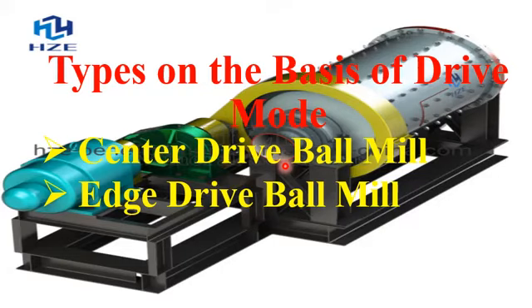The operation of the ball mill is realized by a motor through the reducer. The hollow shaft in the center of the ball mill drives the grinding body to rotate under the driving power of the system. So basically, the center power source, which is present at the fuselage or at the center of the bulk material, is controlling the conversion of the bulk material into a fine material.